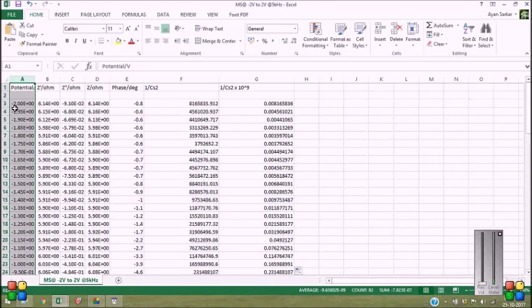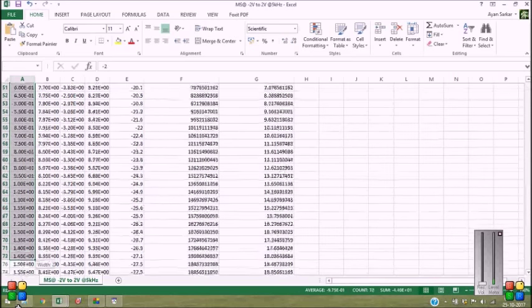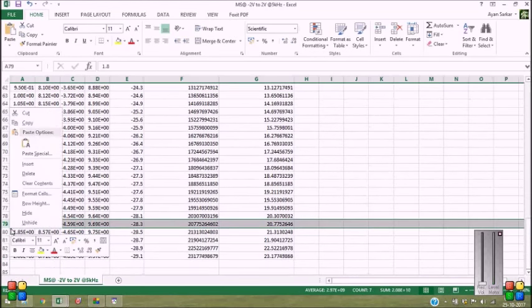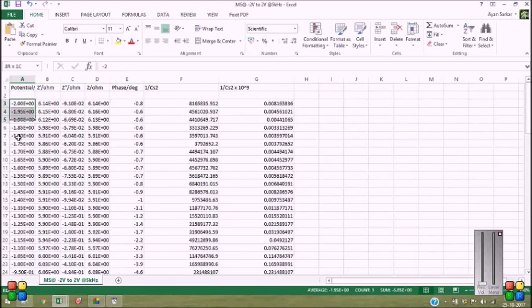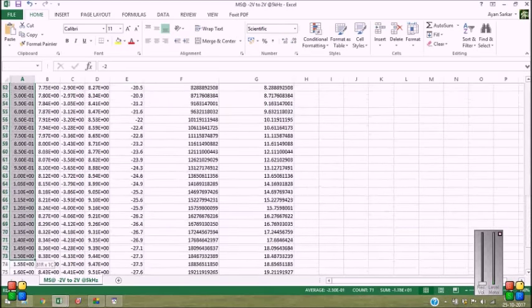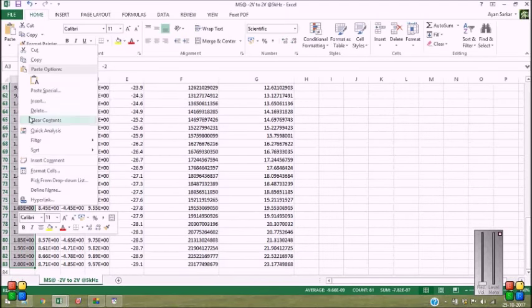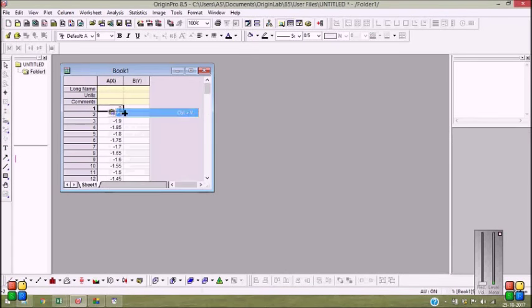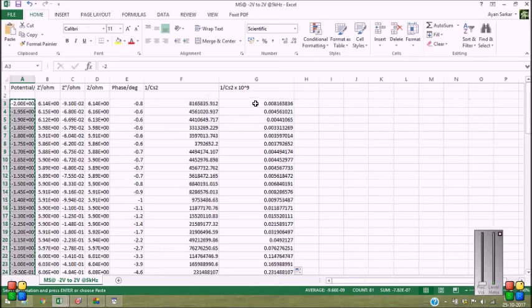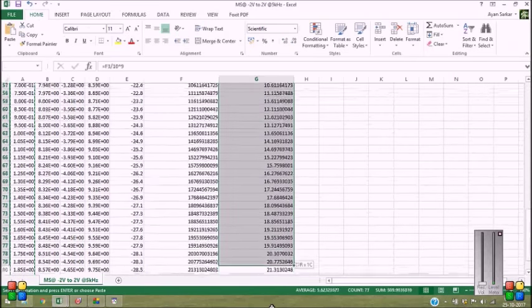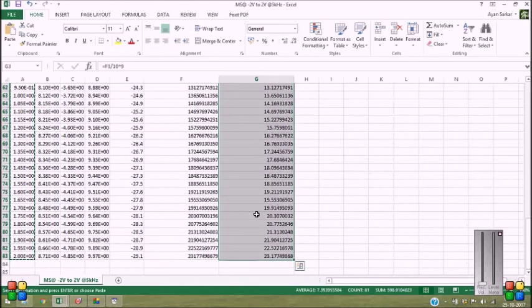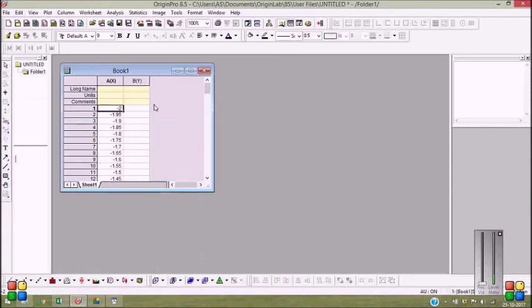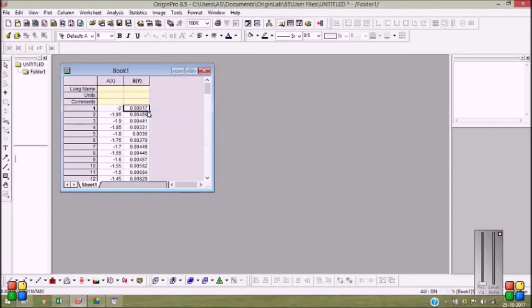So let me copy the potential values. Let's do it for the rest of the values. So let me copy the column A, this is potential, and this is 1 by Cs square.